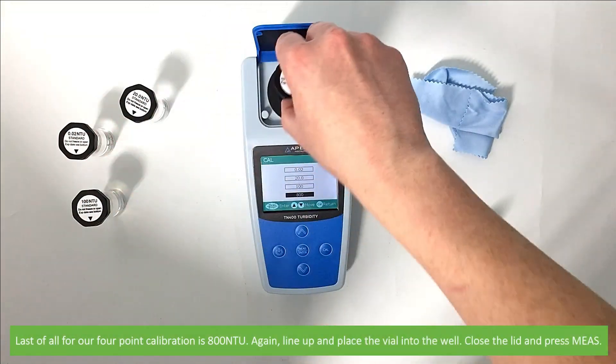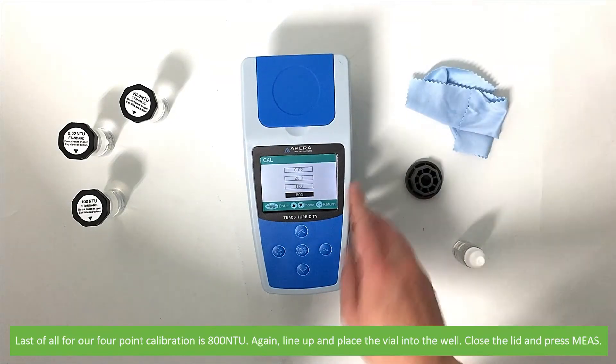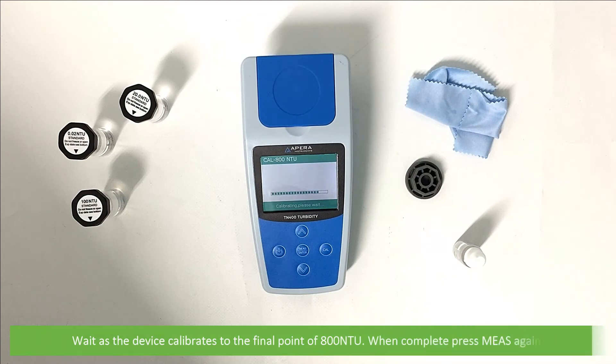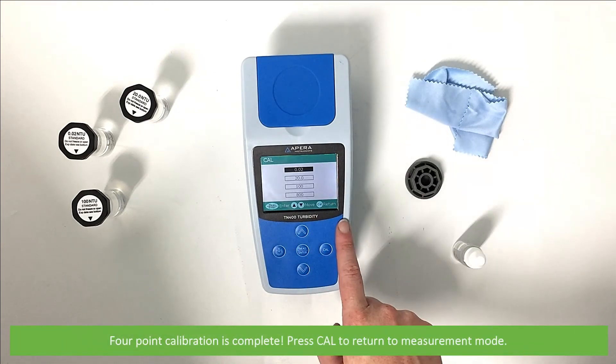Last of all for our four-point calibration is 800 NTU. Again, line up and place the vial into the well. Close the lid and press measure. Wait as the device calibrates to the final point, 800 NTU. Once complete, press measure again. Four-point calibration is complete.